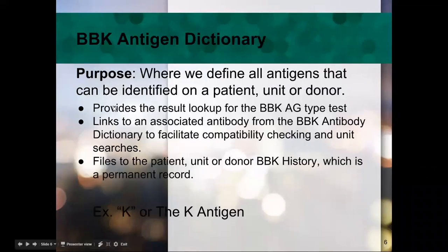So now we're going to move on to the BBK Antigen Dictionary. I'll pause for just a moment to allow any questions to come through the Q&A section, should there be any questions with regard to the source and destination dictionary. But again, we'll just do a quick pause.